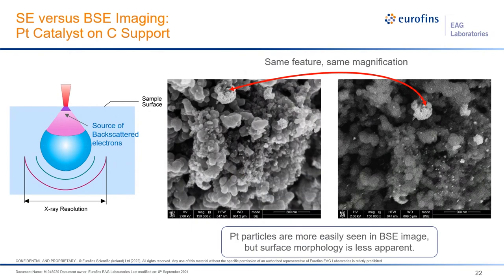Here are two images of a platinum catalyst on a carbon backbone support. The secondary electron image on the left shows topographic contrast — the roughness of the carbon-based support. Switching to the backscatter image on the right, the contrast mechanism becomes average Z number: carbon is low-Z and shows dark relative to the platinum, which is high-Z. Depending on whether you're interested in the surface area of the carbon skeleton or the distribution and size of platinum particles on the catalyst structure, you choose the imaging mode that gives you that advantage.